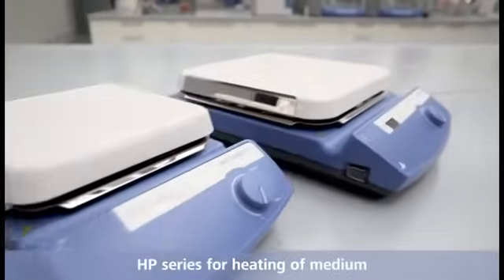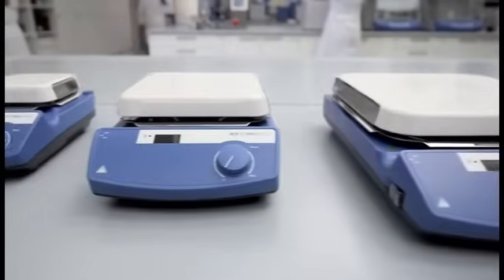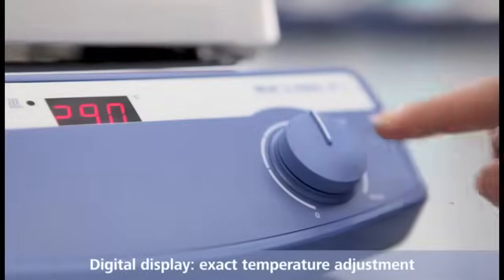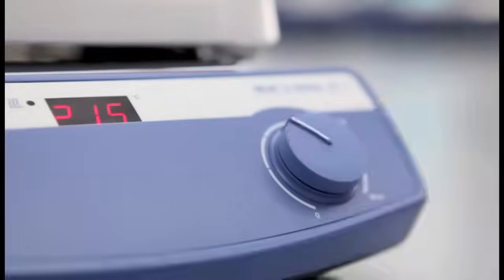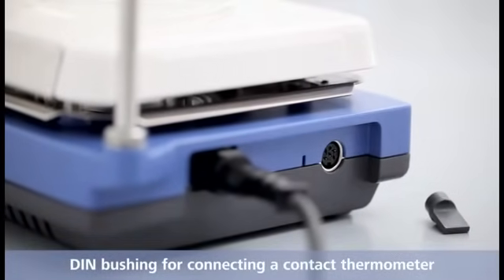HP series for heating of medium. Digital display for exact temperature adjustment. DIN bushing for connecting an electronic contact thermometer.